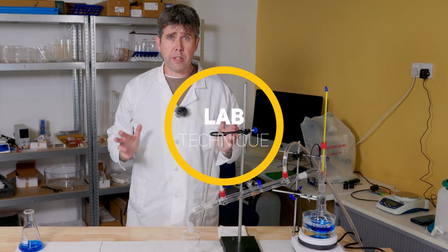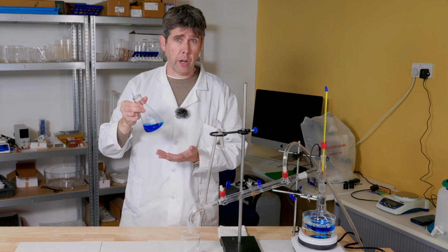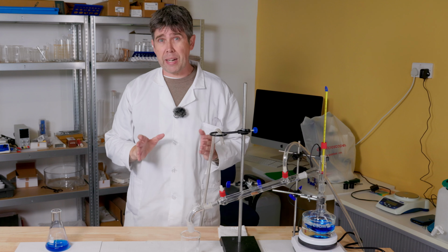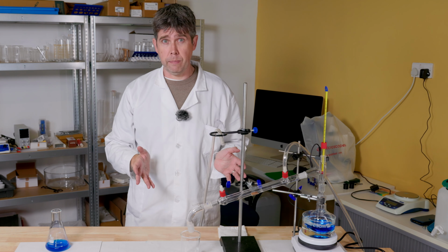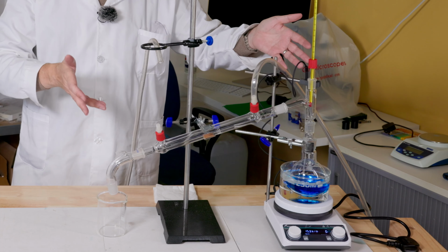For the purposes of this demonstration, my initial mixture is just some water combined with some food colouring. The food colouring has a much higher boiling point than the water does, and so I should be able to get a very clean separation between these two substances. In a modern chemical laboratory, apparatus such as this is likely to be used.